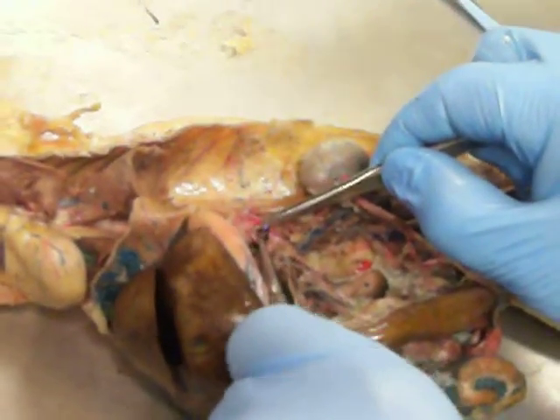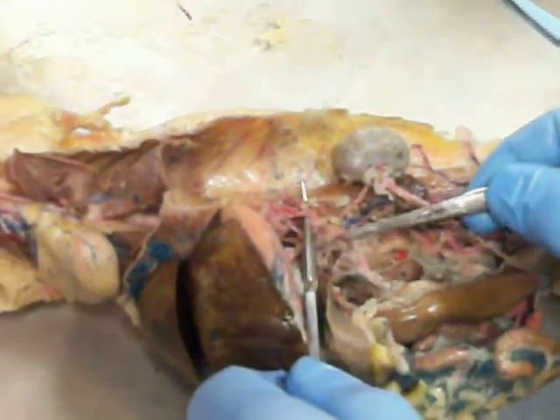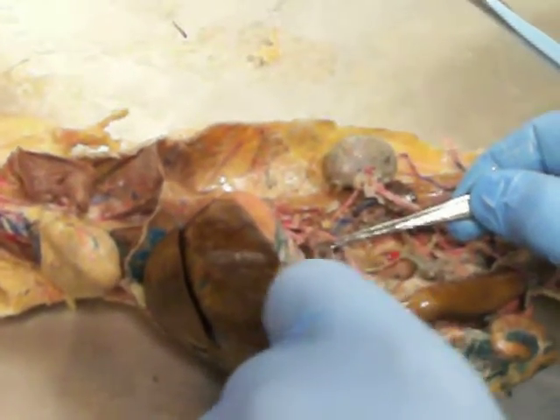Okay, if we go back now to the descending abdominal aorta, which is right here, we're going to have another branch, which is this branch right here. This is the anterior mesenteric artery. This is supplying blood to the intestines.